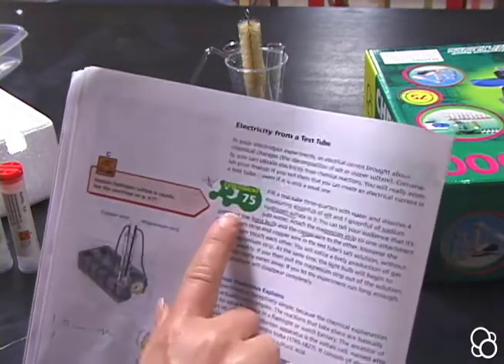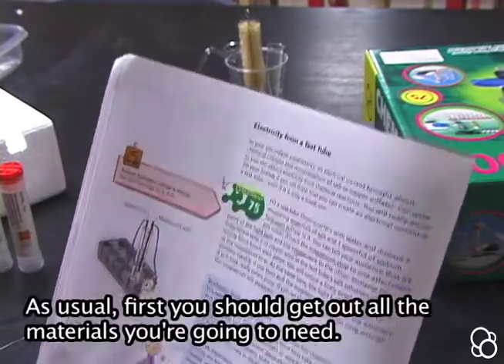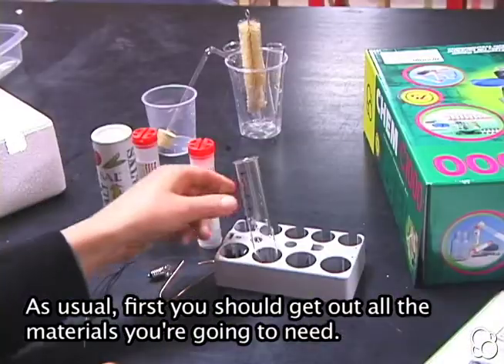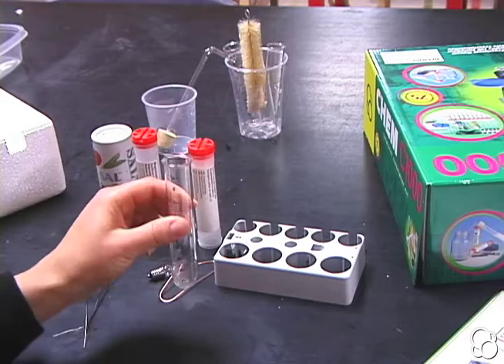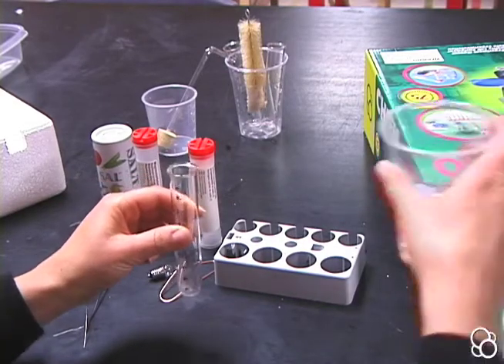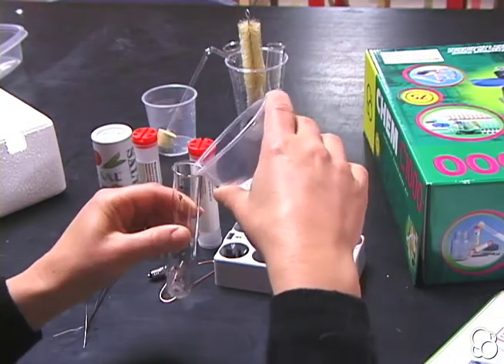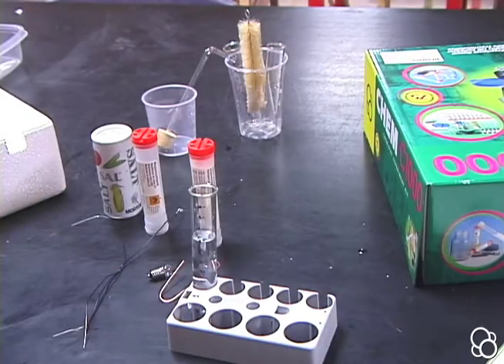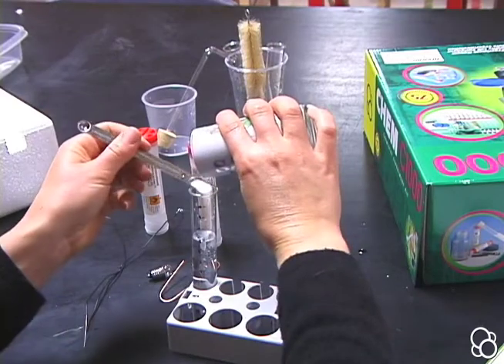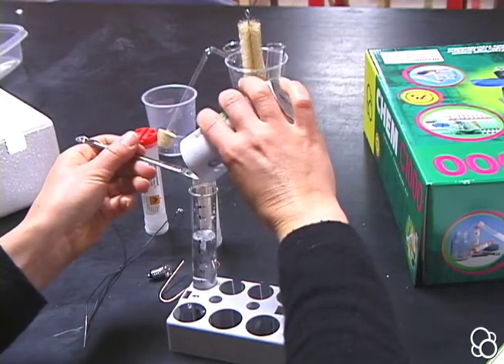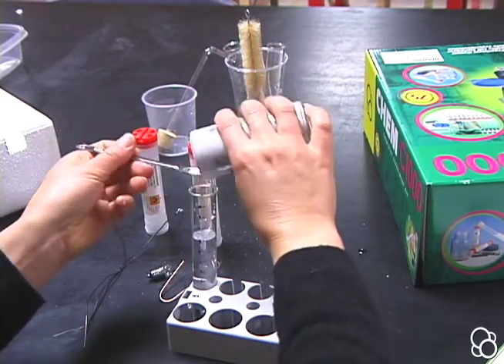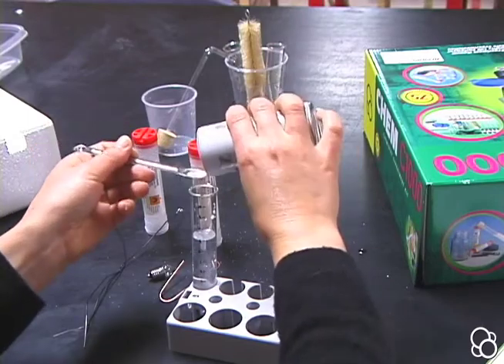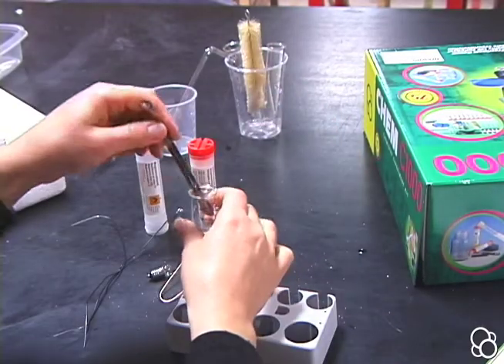Now we're going to do Experiment 75, electricity from a test tube. We're going to start by adding seven centimeters of water into the test tube, and then put four spoonfuls of salt in it. One, two, three, and four. We're going to mix it up.